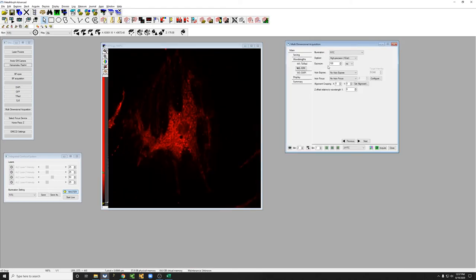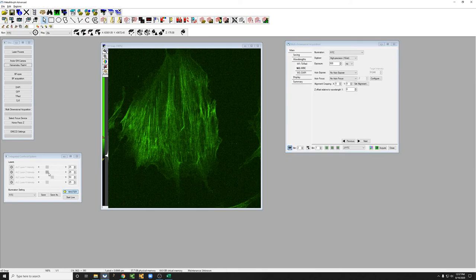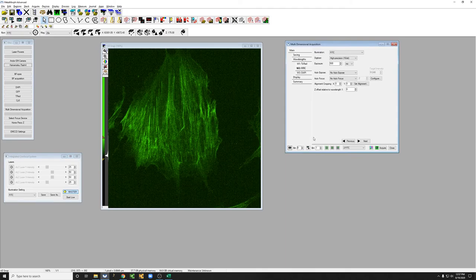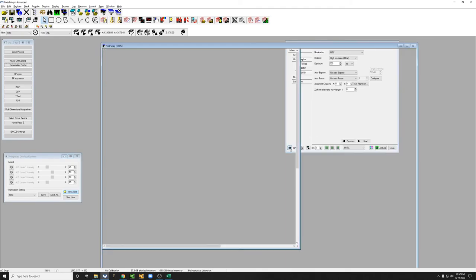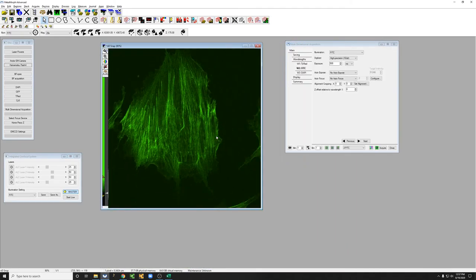Let's look at the FITC now. I'll set this to 500 and take a quick snapshot. I will also just increase the laser power on that one. I'm not paying too much attention to exactly what I'm doing here. I just want something reasonable that we can work with.